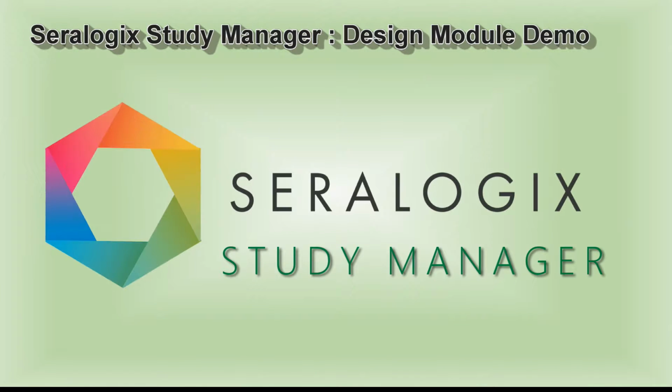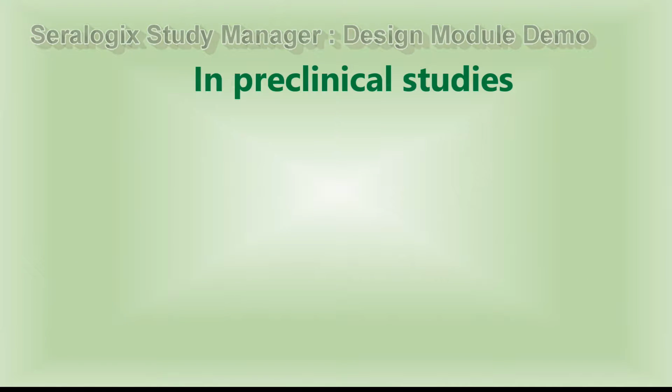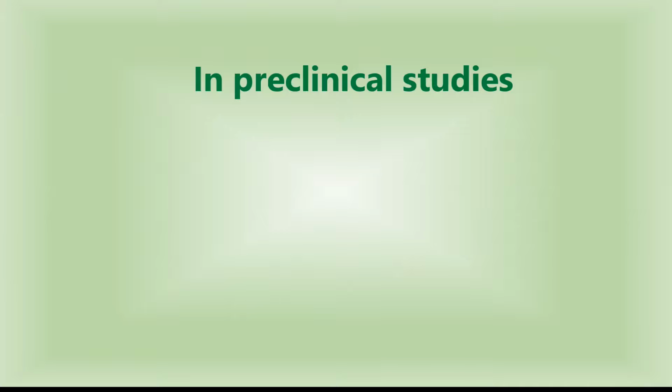The Seralogix Study Manager is the best way to design, execute, and report on your preclinical studies. Preclinical animal studies are very complicated and highly susceptible to errors.